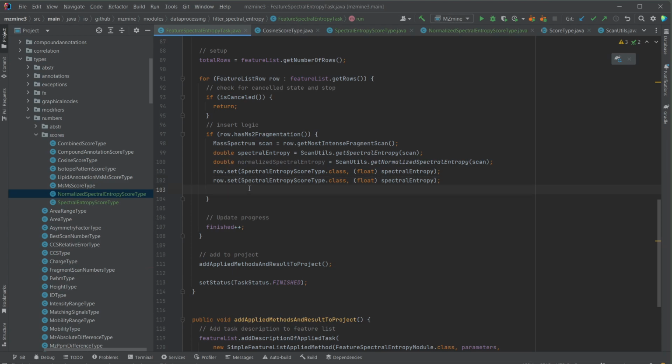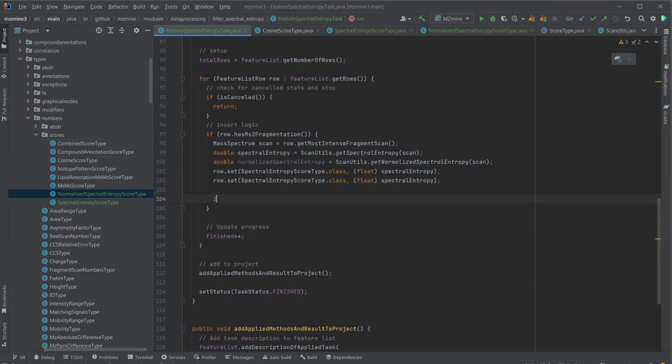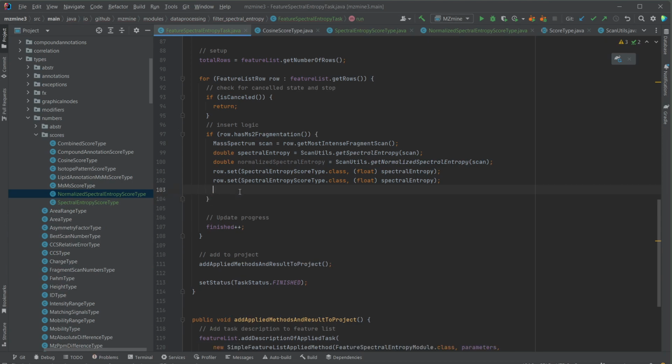So if I define a value, this, for example, might be represented as a double value. And if I now say that 2.0 double and 2.0 float are equal, it looks like it should equal, but it might not. Because this one is a double precision, this one is a float precision, so the precision is not the same. So there are ways of casting the value.